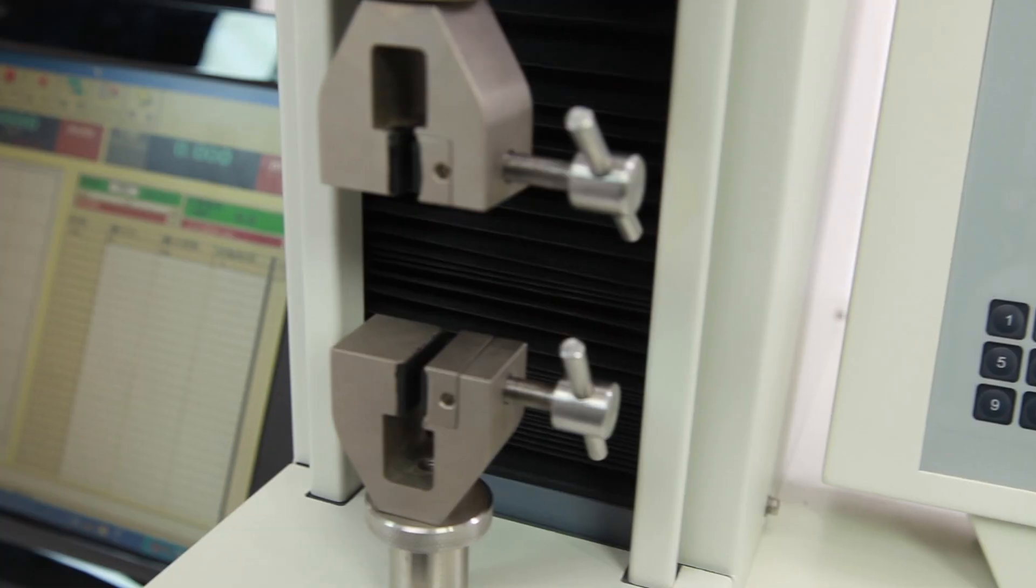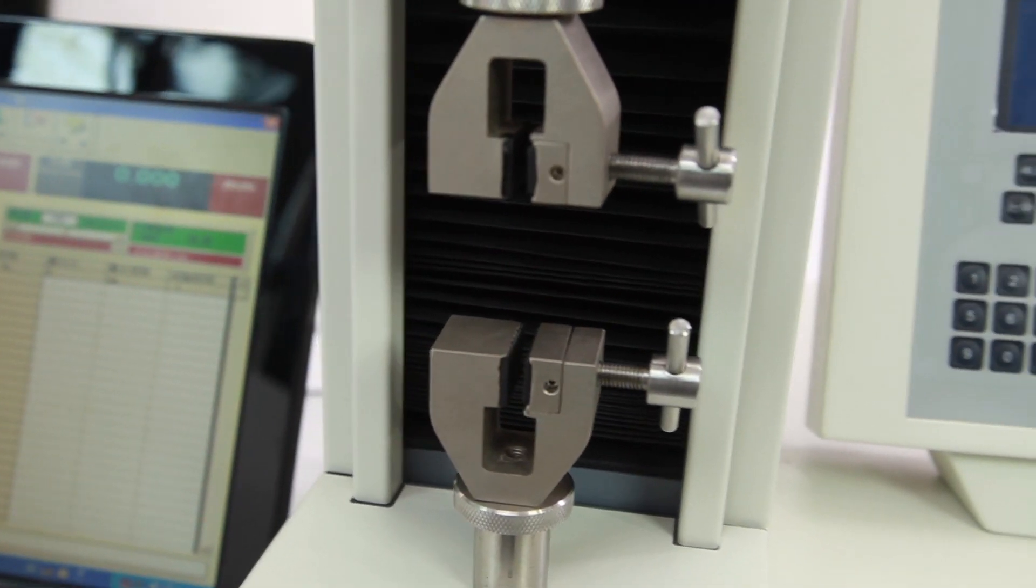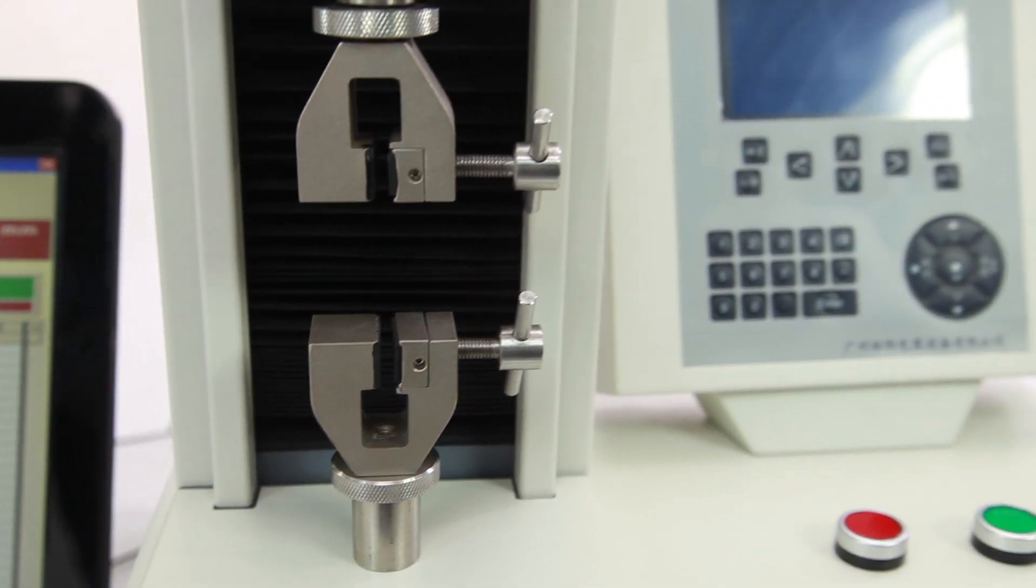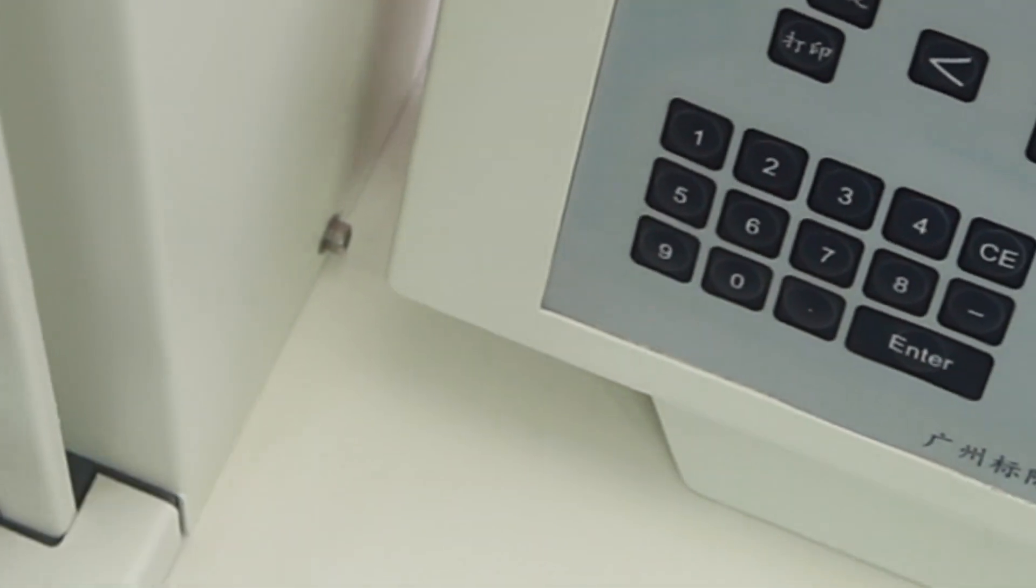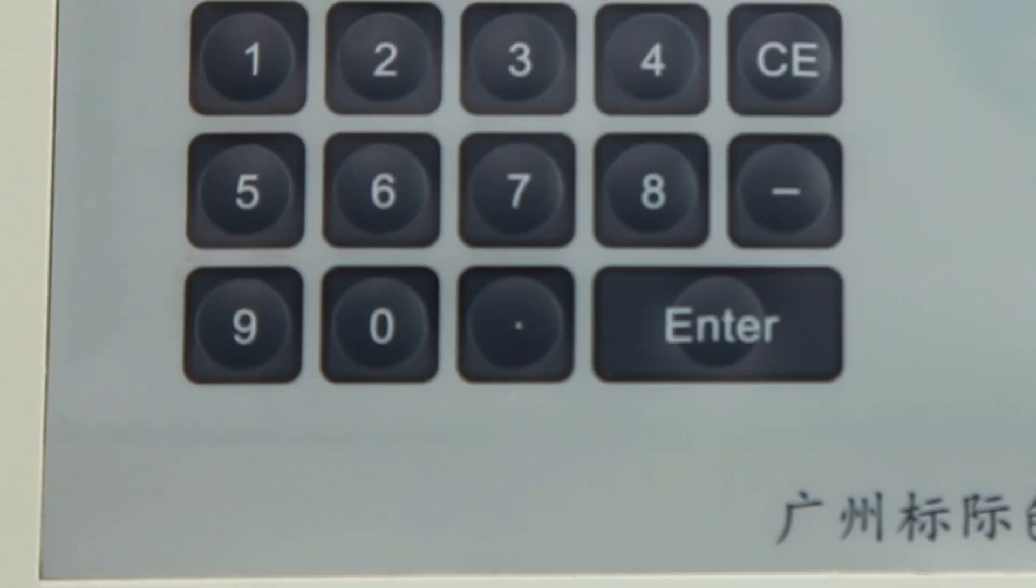GPH1 Electronic Tensile Tester is used to test detraction, stripping, sealing, tear, and piercing of various materials.